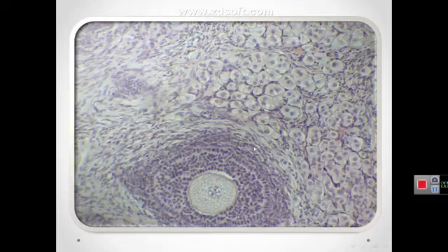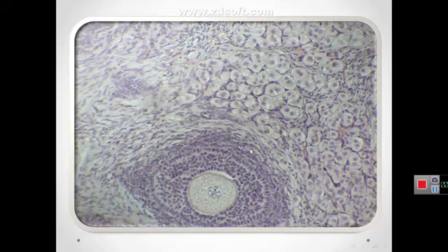The stroma cells outside the primary follicle differentiate to form the theca folliculi, which differentiates as two distinct tissues around the follicle: the theca interna and theca externa.